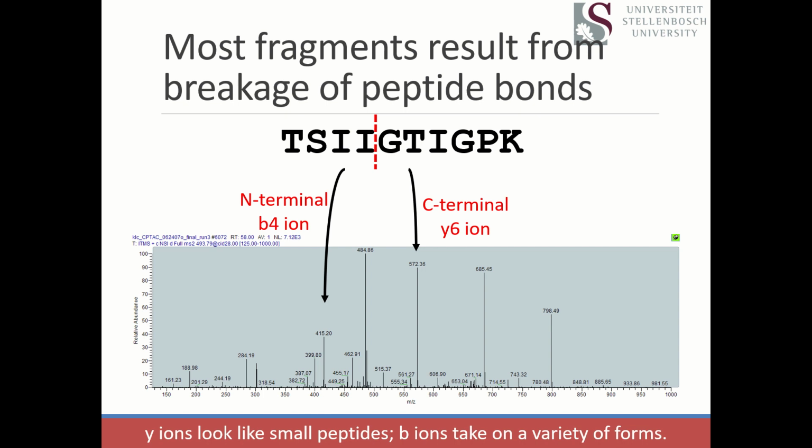No, not a bad guess. But the primary amine is gaining a hydrogen, and the C-terminus of it is adding a what? A hydroxide. So if you add the hydrogen you're adding at the N-terminus to the OH that you're grabbing from the C-terminus together, that's water. So a Y ion is the sum of the amino acids plus water, 18, plus the number of ionizing protons. Okay, so this tells us how to say, does a fragment ion exist in this tandem mass spectrum?